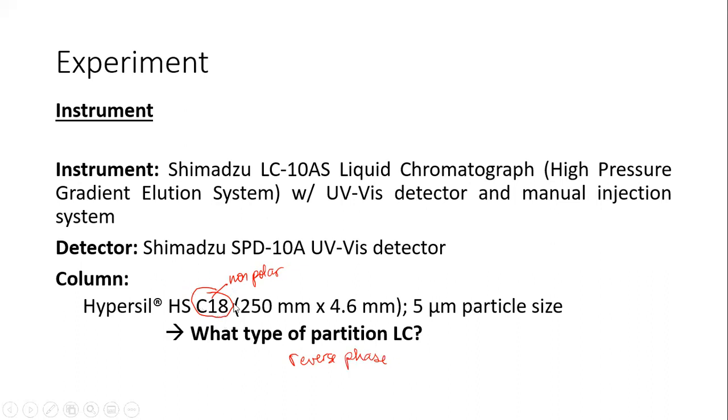Take note na yung sample kasi natin, the analyte is also a non-polar compound. Okay.